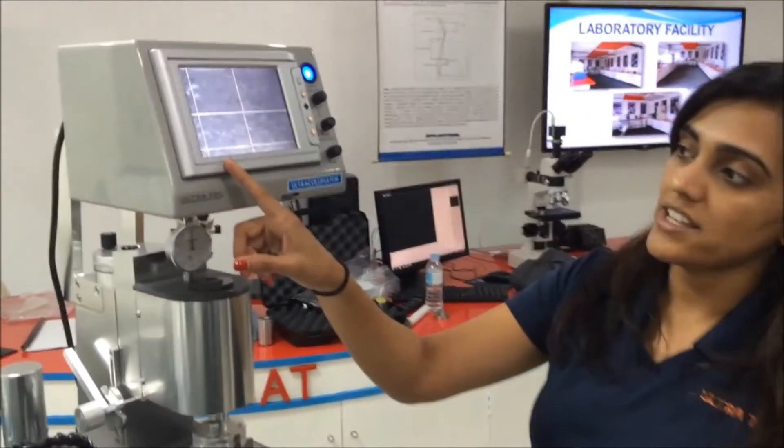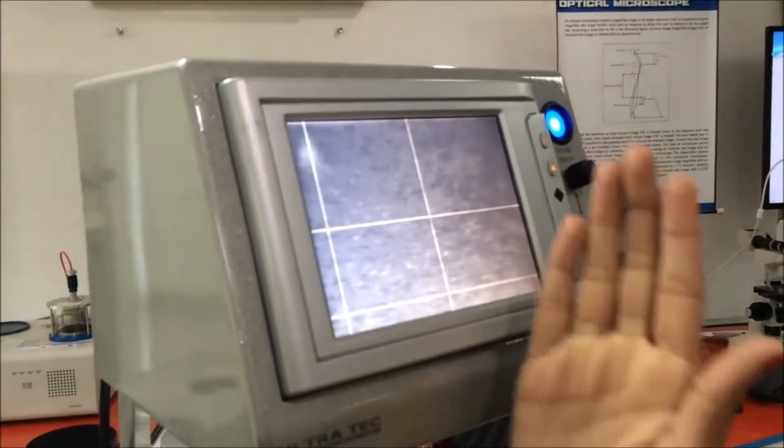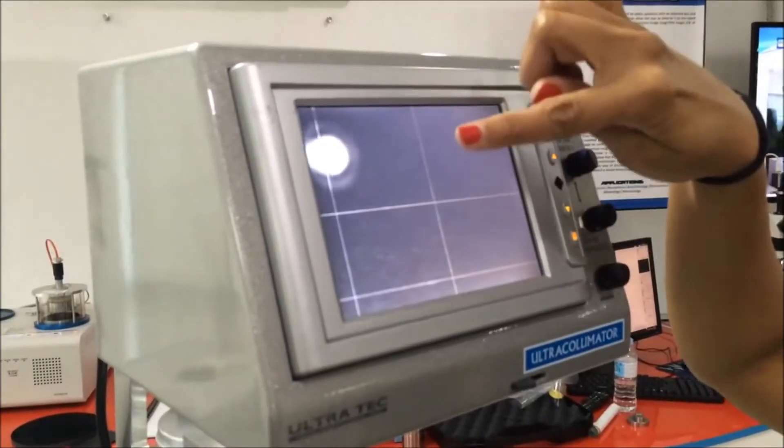So what we're looking at here is you can see that there's a rotation but it's outside of the area of the location of where you want it.